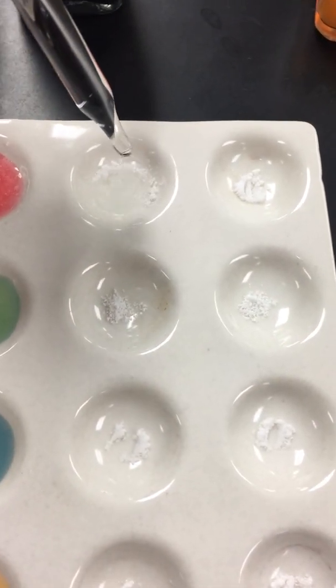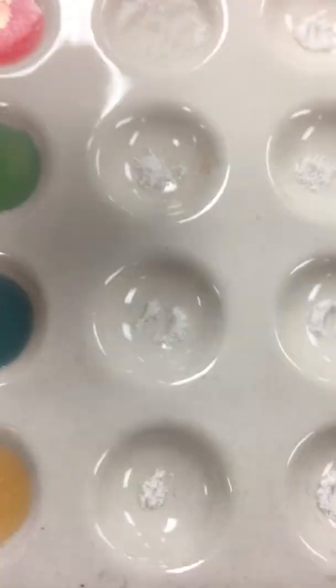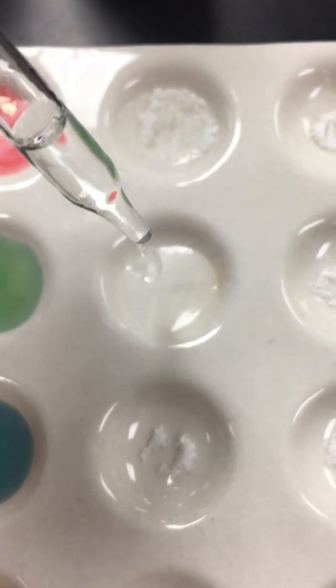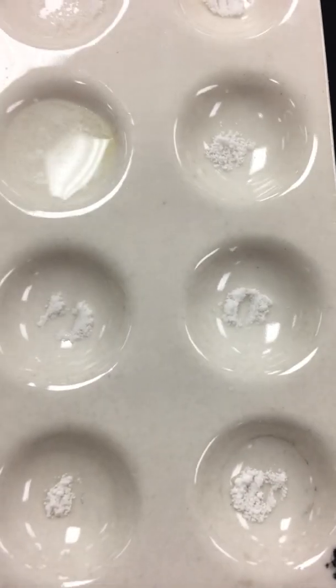All right, so we're going to add it. No real reaction, doesn't look like. All right, we add it to this one. See if I can do this without spilling. Get some more hydrochloric acid.